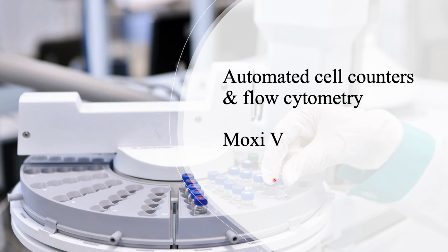In this lecture, we're going to explore a very brief explanation about flow cytometry and automated cell counting, specifically with respect to this instrument we have in lab called Moxi V, and we'll be using it in our lab to count cells.